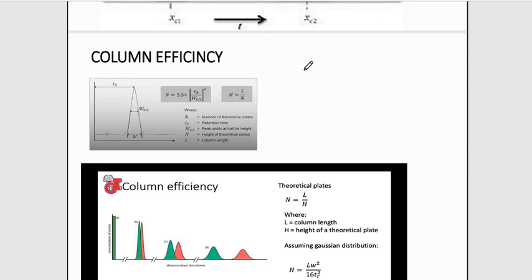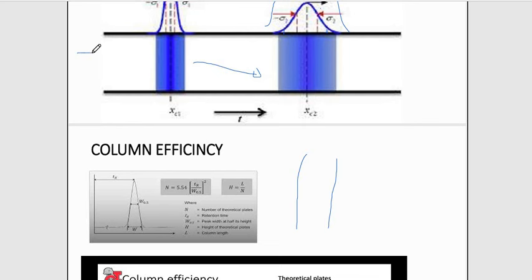Now, for a chromatography system, there is an idea that we have to know. If I add my analyte to this column, at this particular region, it moves down the column. The separation is basically based on the differential affinities of the analytes to the adsorbent particle, that is, the adsorbent. What enables the separation of the analyte is basically that the analyte is going to be distributed differently between the mobile phase and the stationary phase.